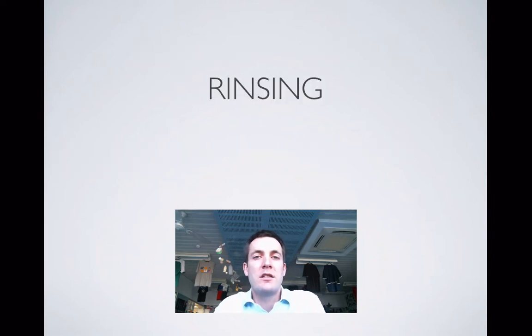You might not be surprised to hear that the first thing we're going to look at is rinsing. Just like with a volumetric pipette, it's important what you rinse a burette with. Because you're filling it with a solution whose concentration you want to know or be very confident of, you don't want to dilute that solution or add any contaminants to it.